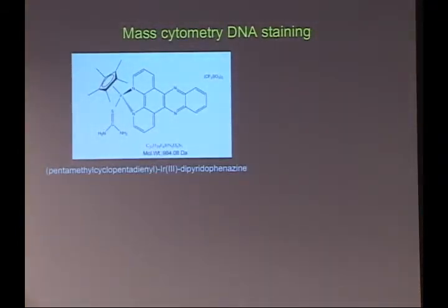So why do we need to do something different for CyTOF? Well, this is the intercalator that we use in CyTOF, and from the labs yesterday, this is what we added at the very end. It's sort of an intercalating ring structure here that coordinates an iridium ion, and then this, in theory, intercalates into the DNA, and then we can detect the iridium.